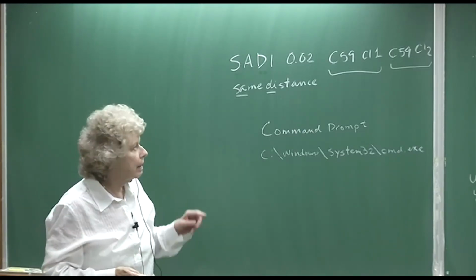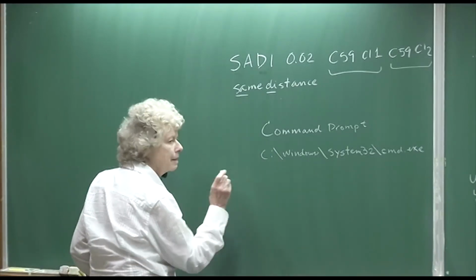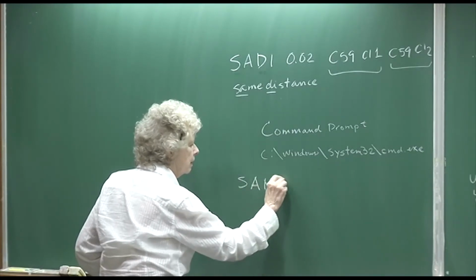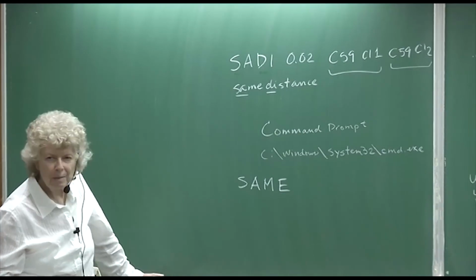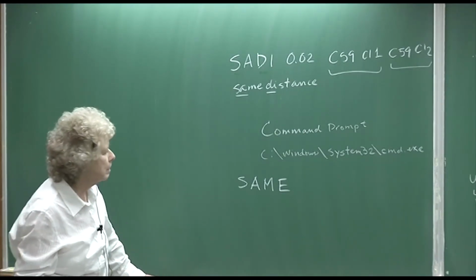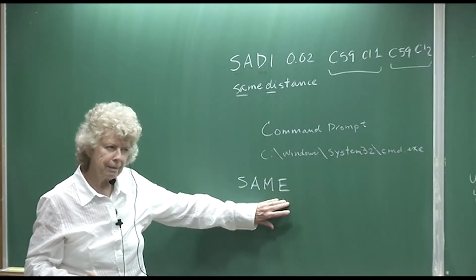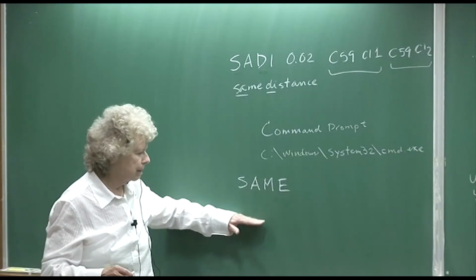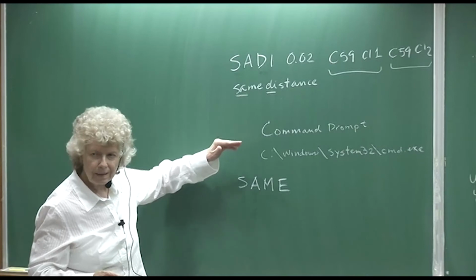And then there's one other constraint that you could use, or restraint, I guess is what he calls it, SAME, which also works. It's a little tricky sometimes to apply. With SAME, you don't put in a preconceived distance. You're just requiring a sequence of atoms to be the same as another sequence of atoms.